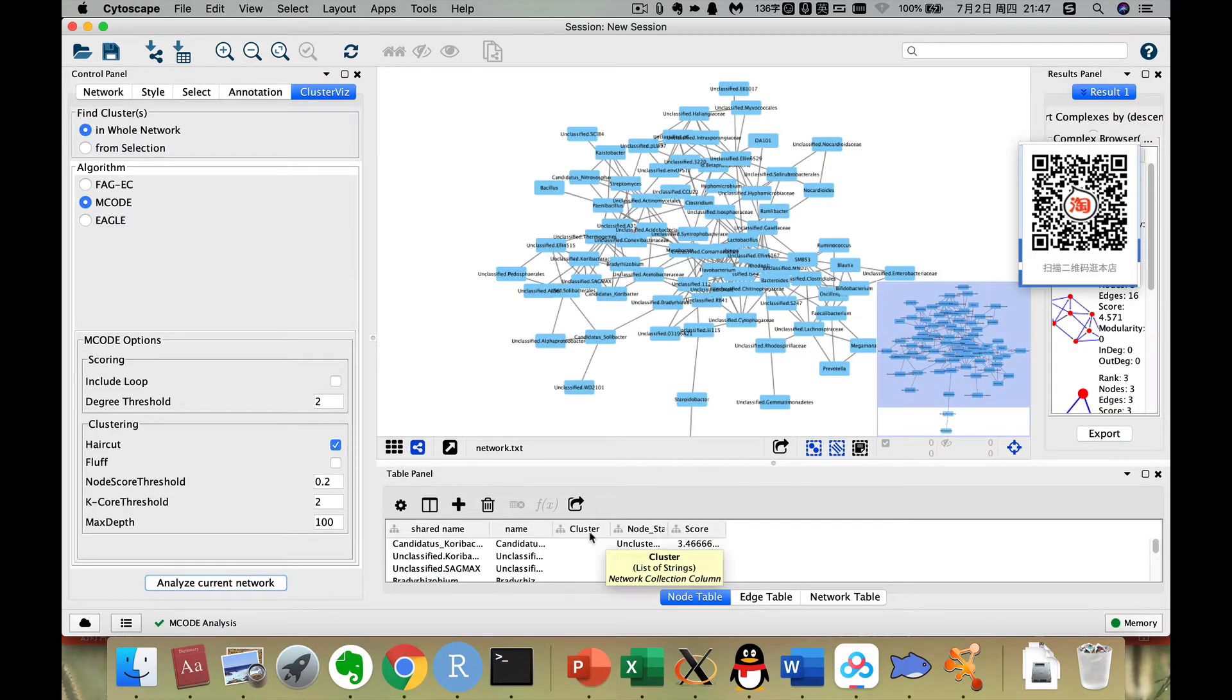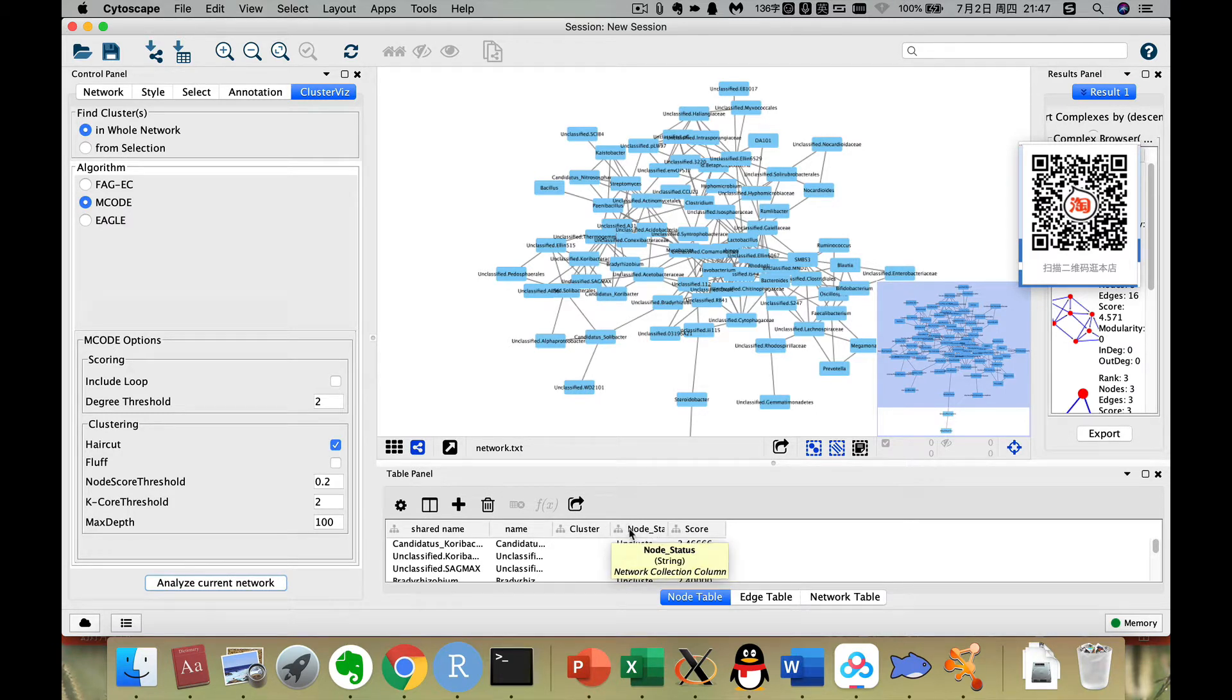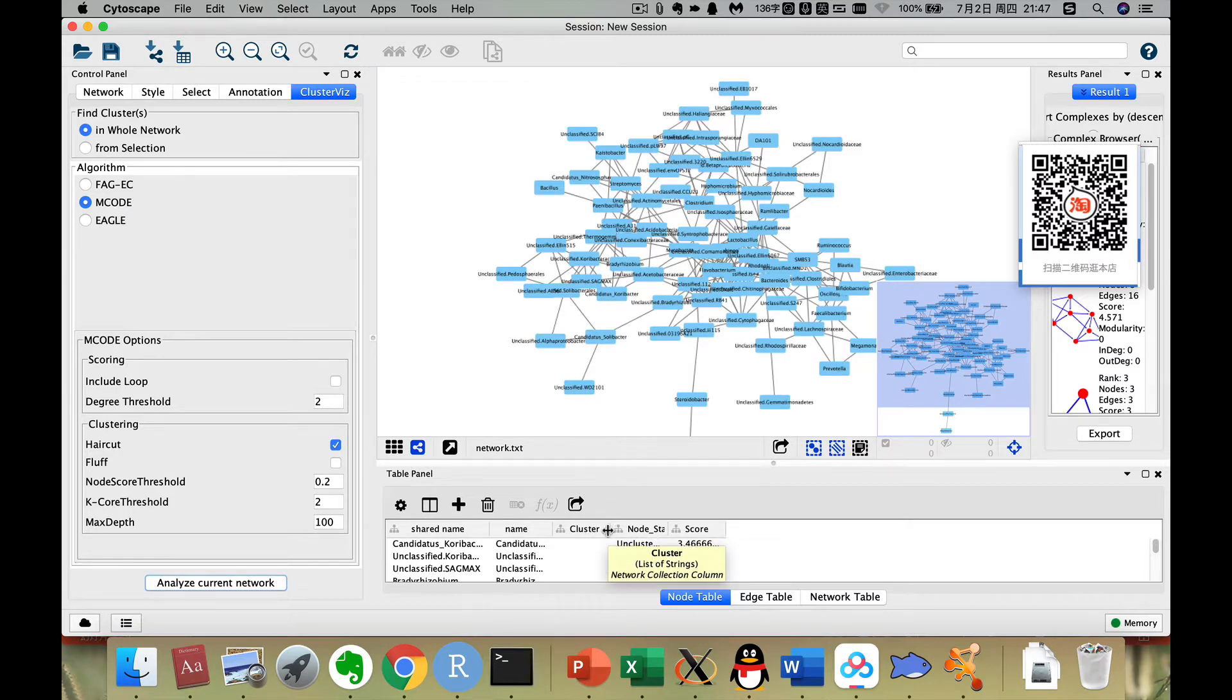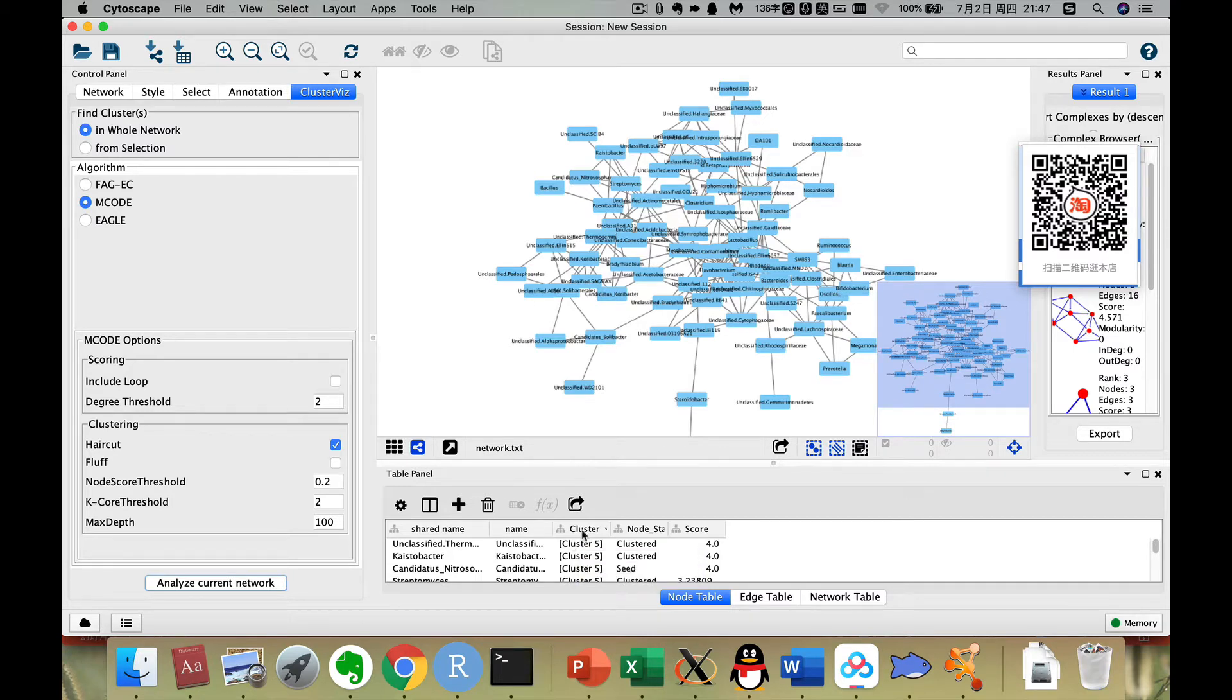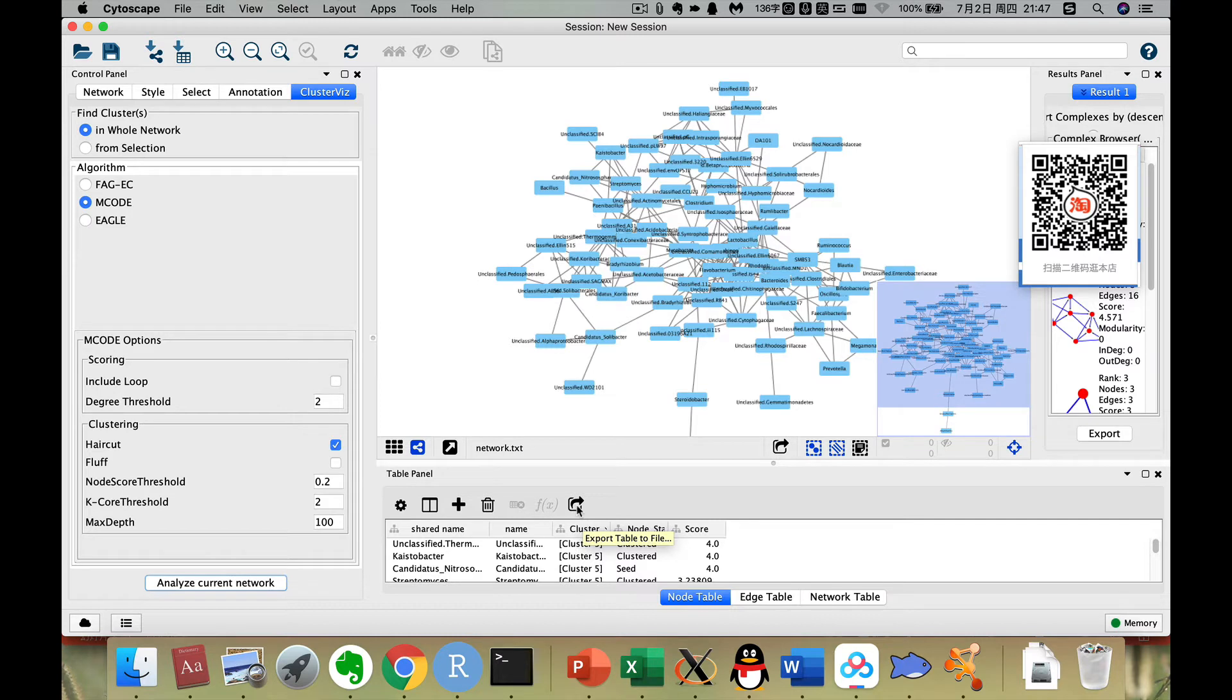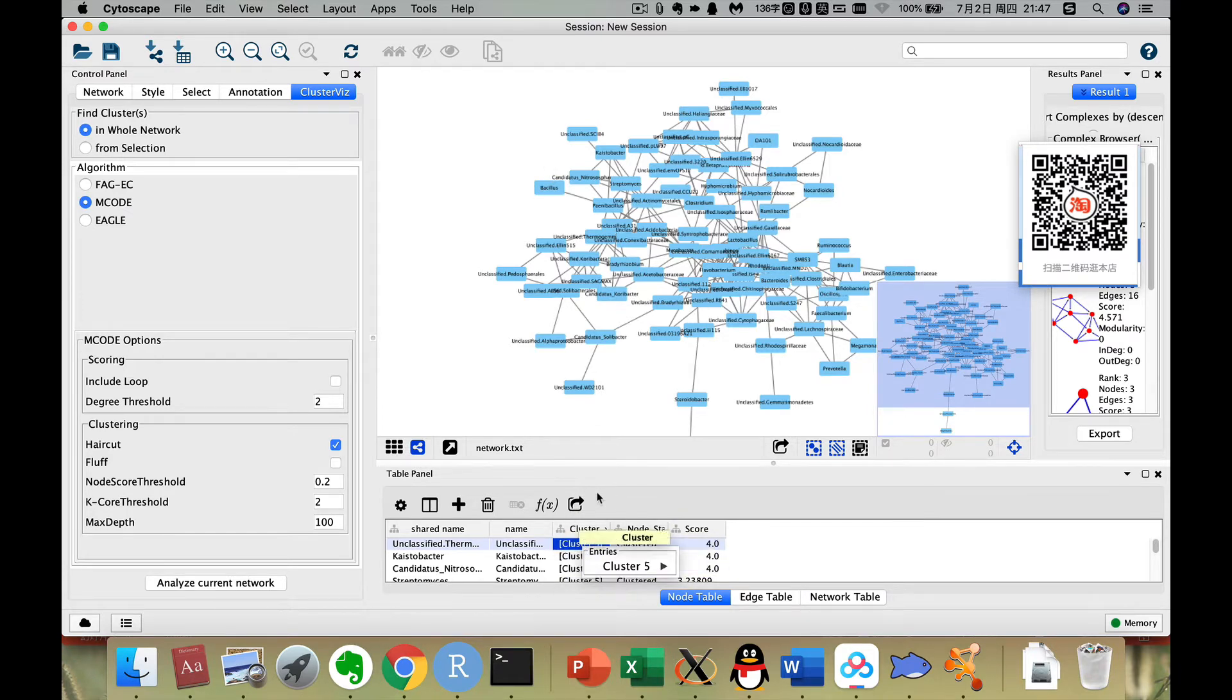Now here we can see the node table. So here it has several new attributes. Here is the cluster. Now we can see it has five clusters. Now first, we export this table out because their attribute cannot be used as a layout. So we need to hand modify it.